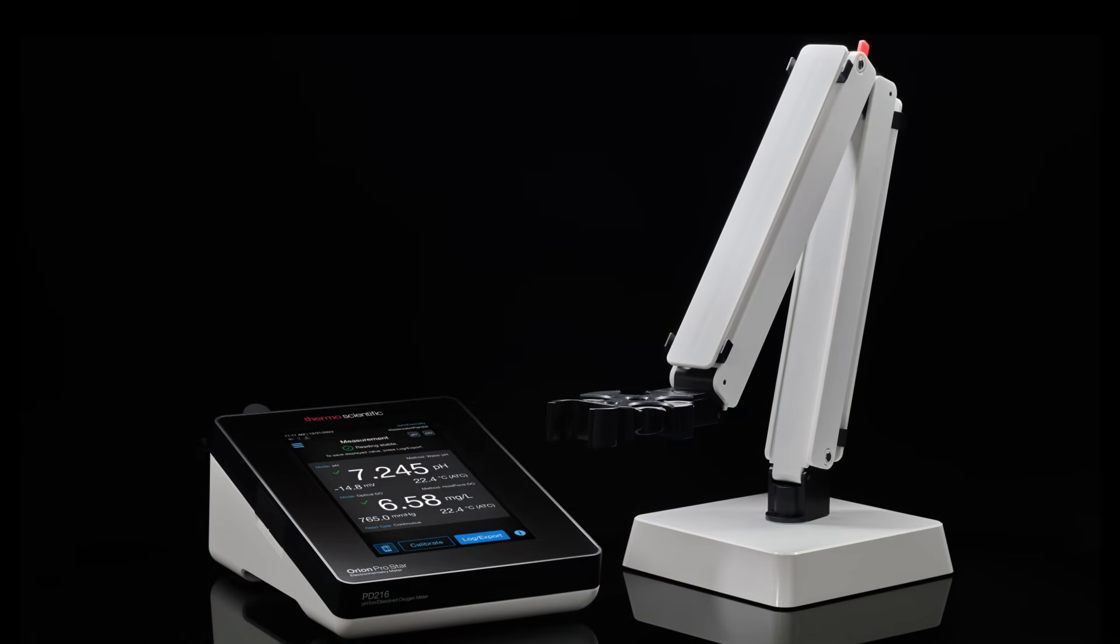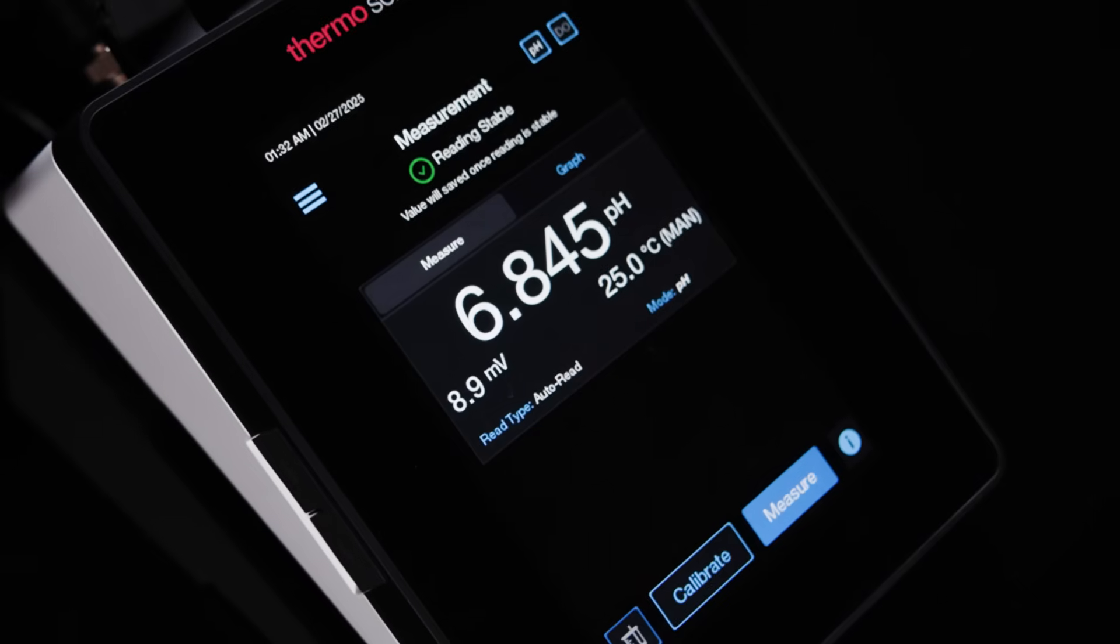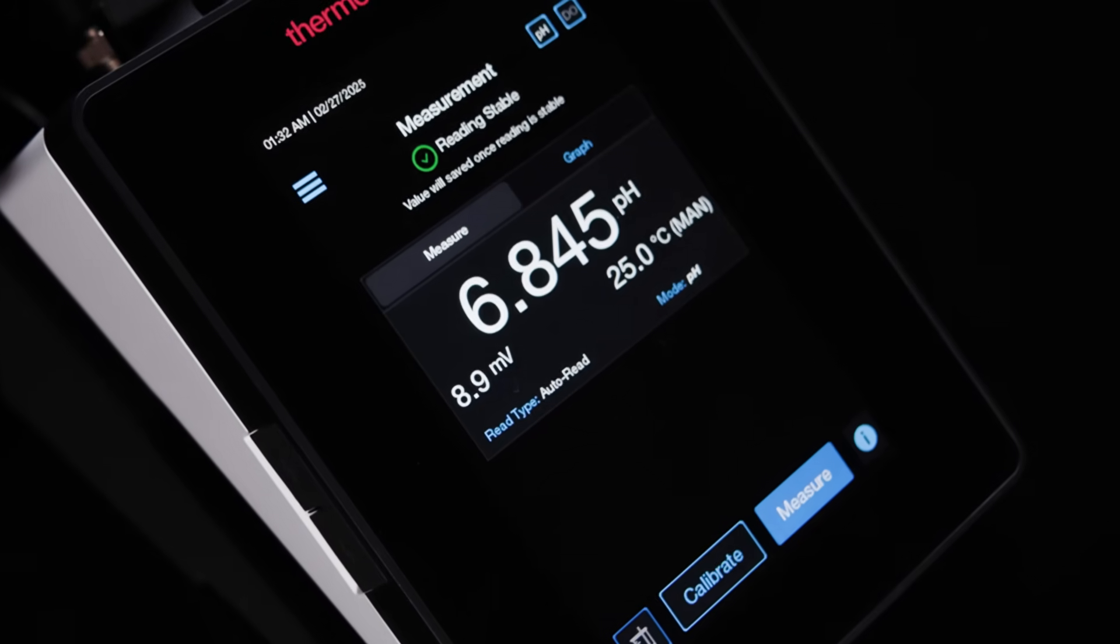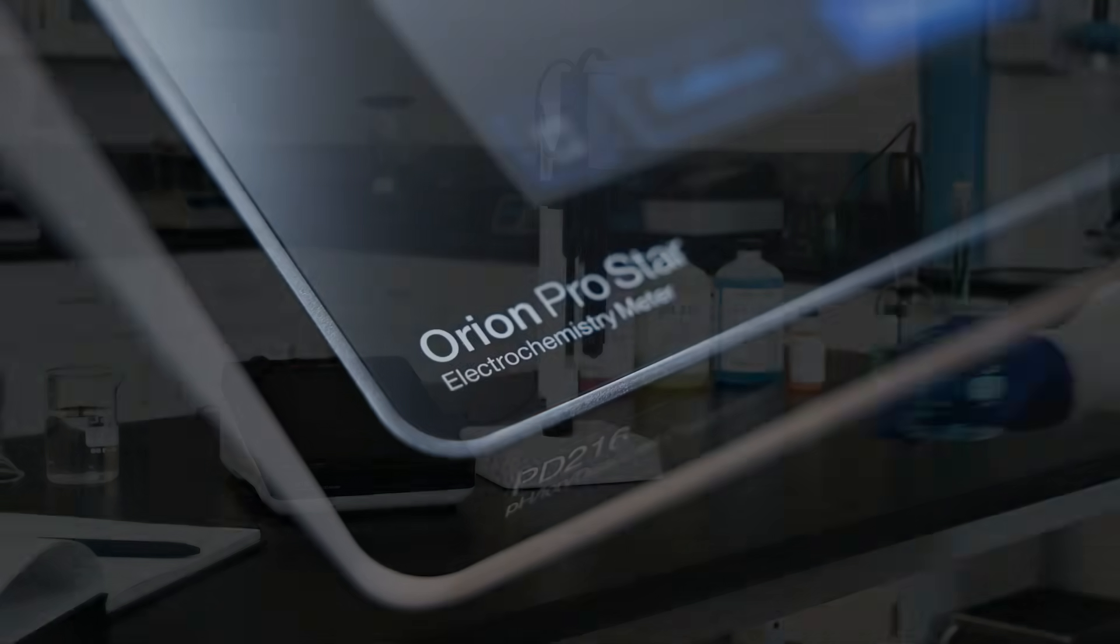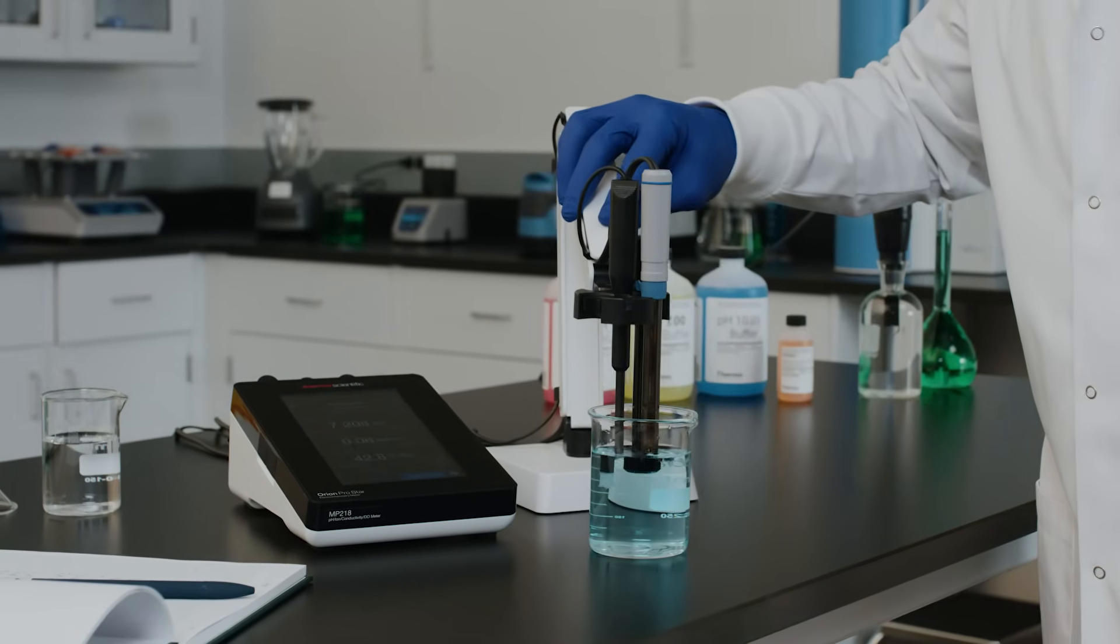Introducing the Thermo Scientific Orion ProStar Electrochemistry Bench Meter Series. Designed to provide accurate and reliable electrochemistry testing, the Orion ProStar supports the way you work.